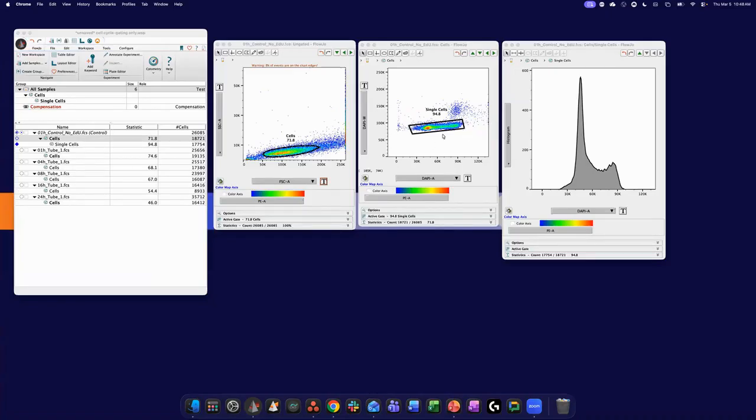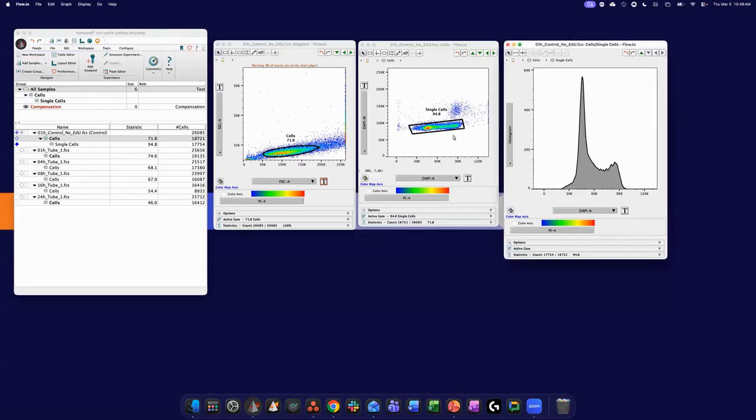Okay. And what you'll probably see in a polyploid experiment is instead of just two distributions here, you'll have maybe one, two, three, four, right? So more distributions, but still nothing up with a longer kind of time of flight. Okay. All right. So again, just explaining the importance of cleanup here. Unfortunately, these parameters were not collected on the rest of the data, so I can't show it to you on all of them, but it was collected on one, so I thought I would just show it as an example.